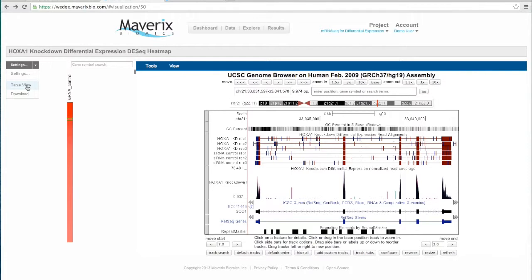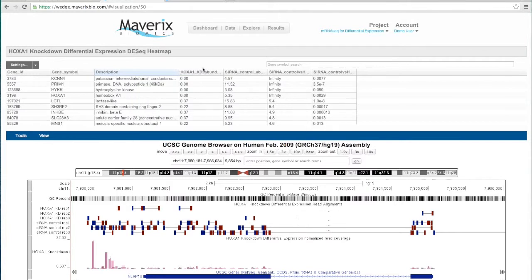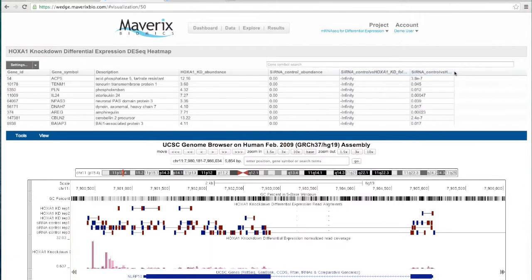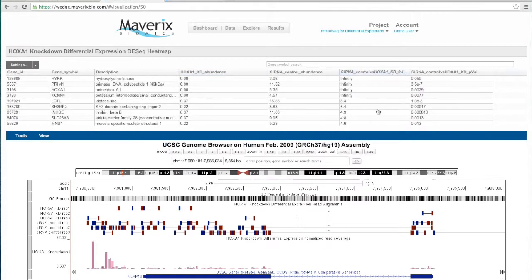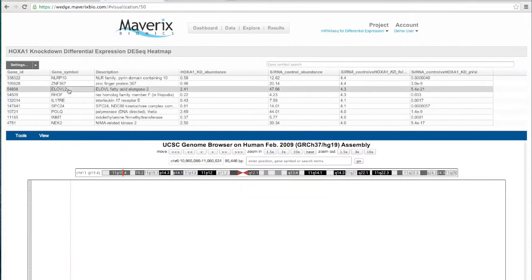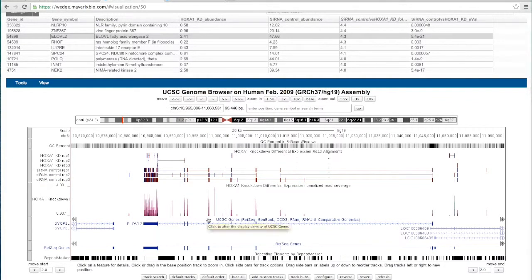Another way that you can view this is the same data set that's underlying this heat map can be viewed in a table browser. So this table view allows you to sort this interactively and view any of the data based on any kind of sorting you want to do. So you could sort this by gene symbol, you can sort it by the abundance values, by the p-value, as well as the log2 fold change between these. And just as with the heat map, clicking on any of these rows within the table will load that within the integrated genome browser here on this side.